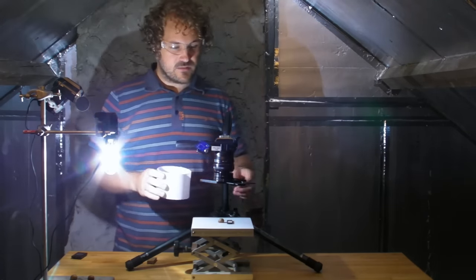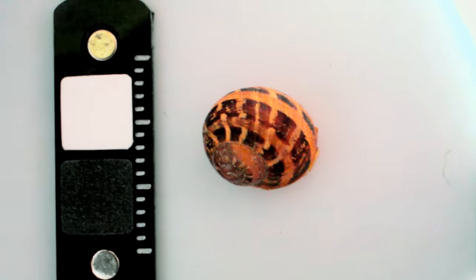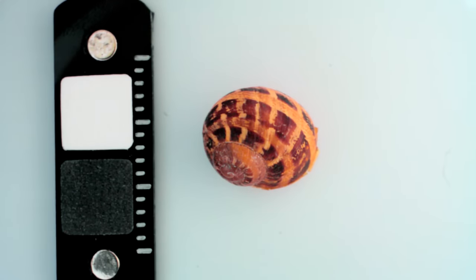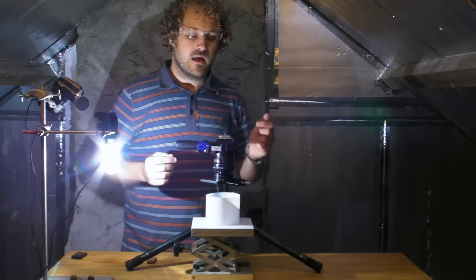And if I place this around the scene, you can see how it almost eliminates all the shadows from around the snail. So now when we measure the reflectance all over the snail, we'll have a pretty good estimate of its reflectance in comparison to the grey standard here.